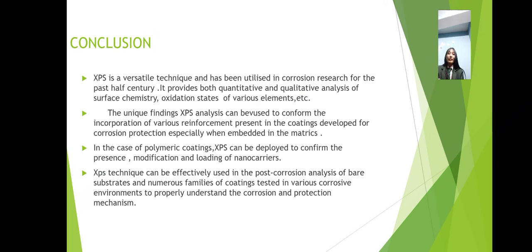Last but not least, we are now at the conclusion part. I would like to conclude my presentation by saying that XPS is a versatile technique and has been utilized in corrosion research for the past half century.